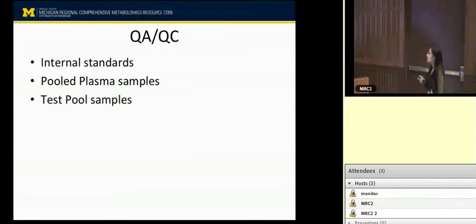Based on how many peaks match, a score is assigned. Not just the characteristic peak but the other fragments, how they match, a score is assigned to every identification. And also, LIPID MAPS gives the fragment formula, or so to say, the fragment information, what each of these fragments could be and how they are coming from the total formula. So this gives detailed information, and how many of these peaks match can tell you what the identification probably is.